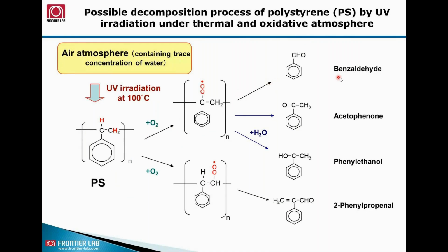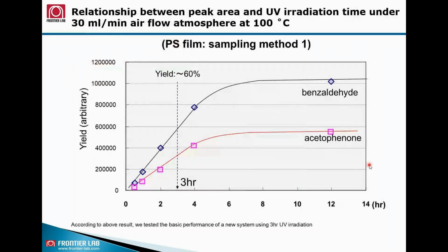So it forms benzaldehyde and acetophenone, and because of traces of water in the air, also shows the formation of phenyl ethanol. Particularly in this case, you can also calculate the amount of benzaldehyde and acetophenone formed, and that can be related to the degradation of the polystyrene film.